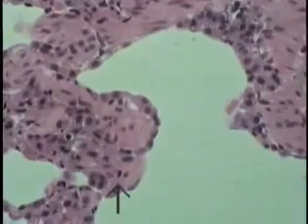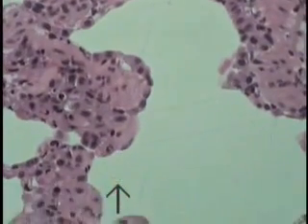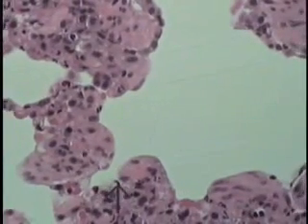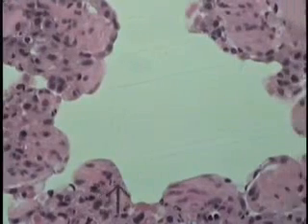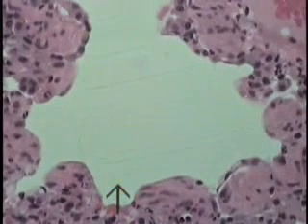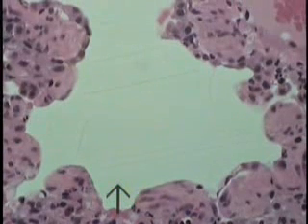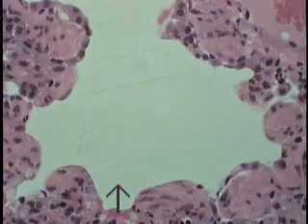So these short transitionary points, this is what is being presented as a respiratory bronchiole, this very short transition point between the conducting portion and the appearance of alveoli, and then a purely respiratory region, as one will encounter in the alveolar ducts.